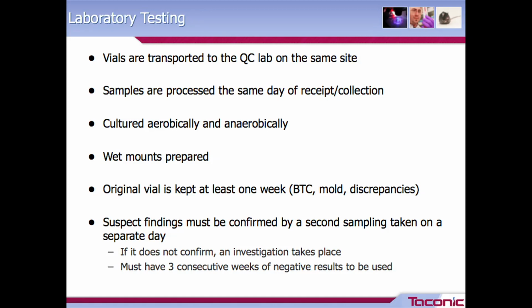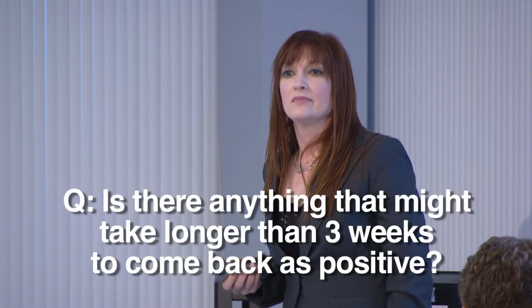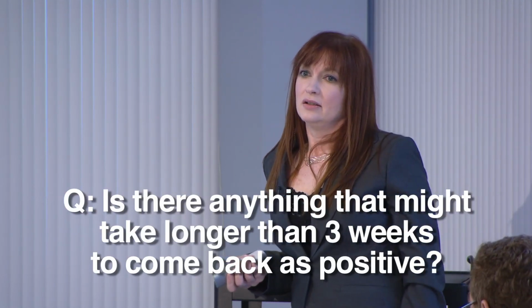Any questions about that? Question. Are you concerned with anything that might take long? Is there anything that might take longer than 3 weeks to come back as positive, and therefore would that 3 week period not be sufficient?